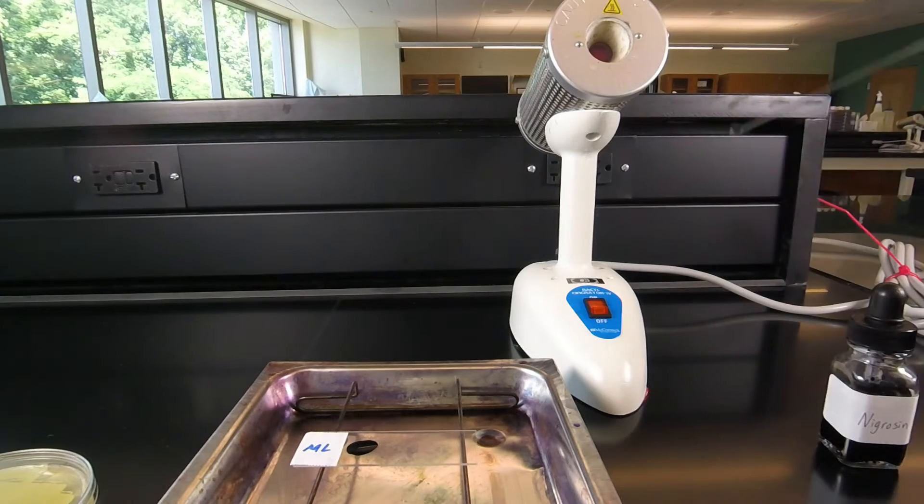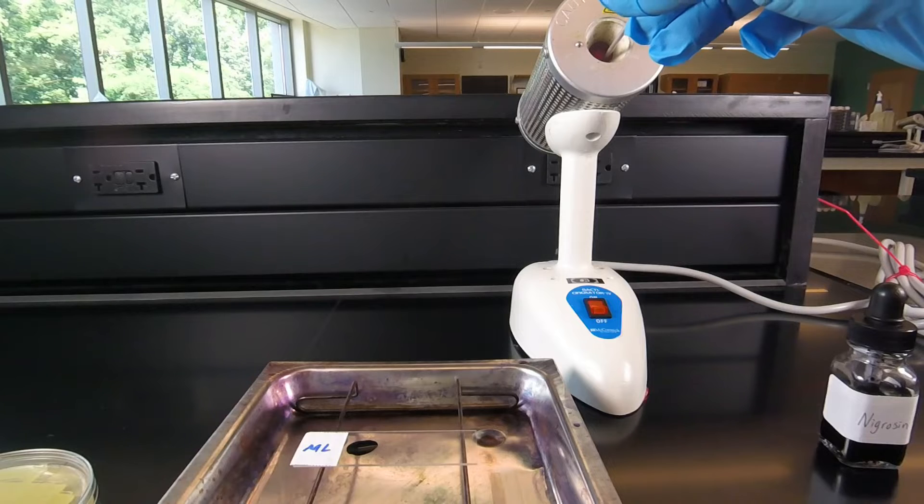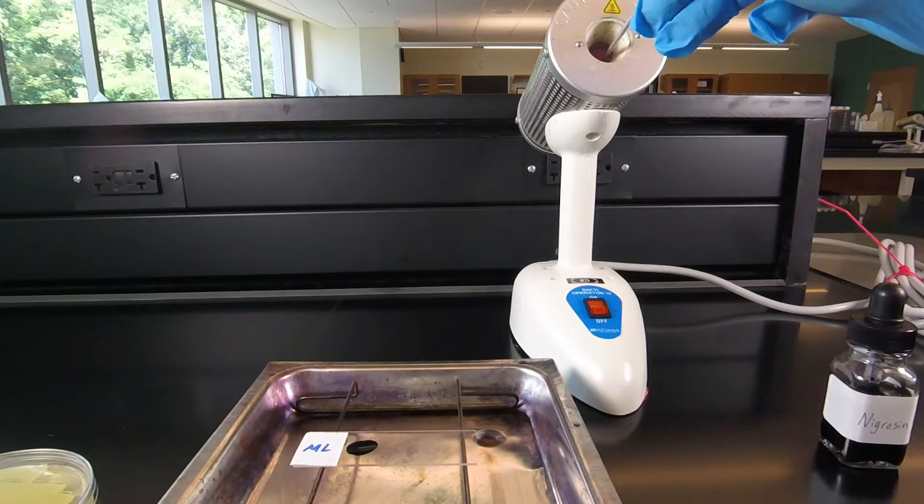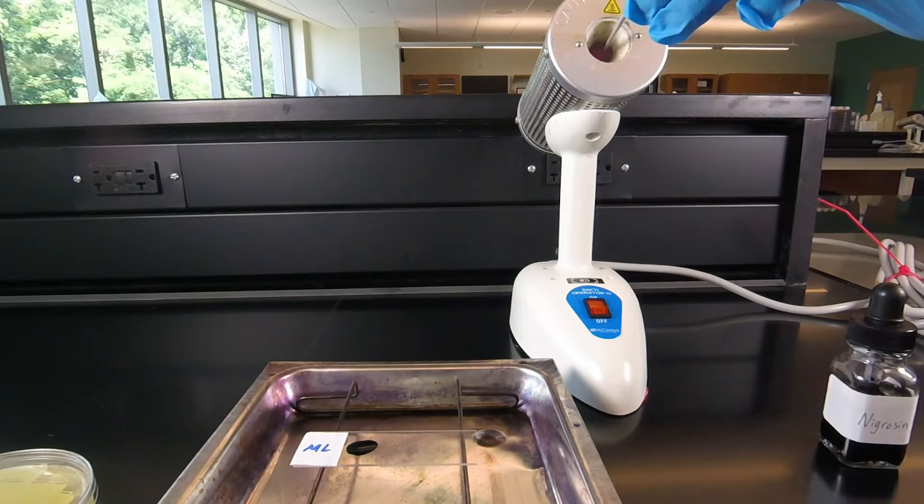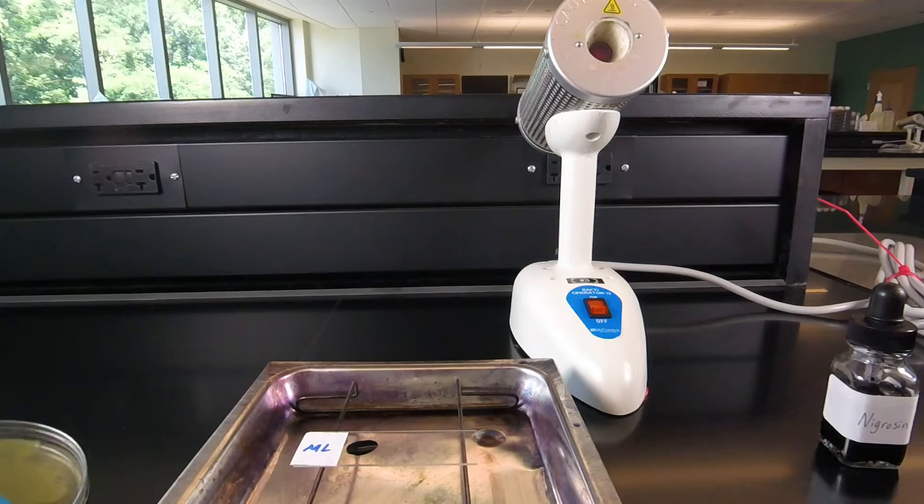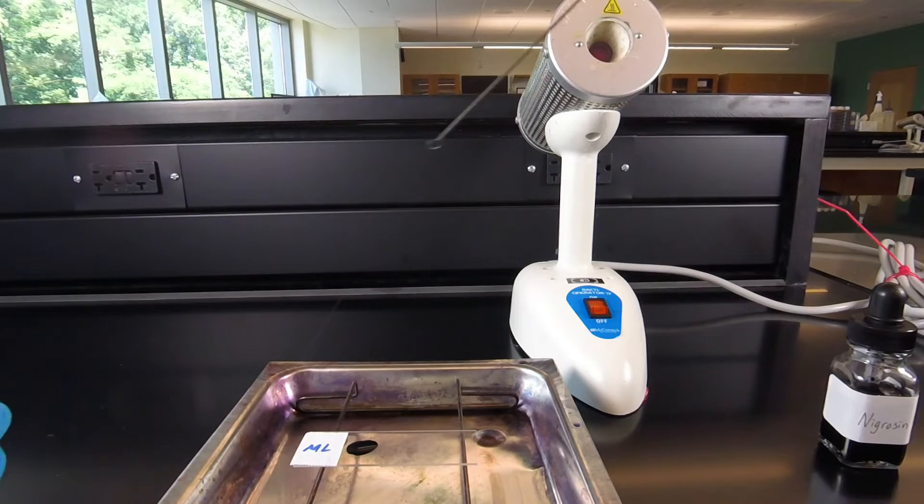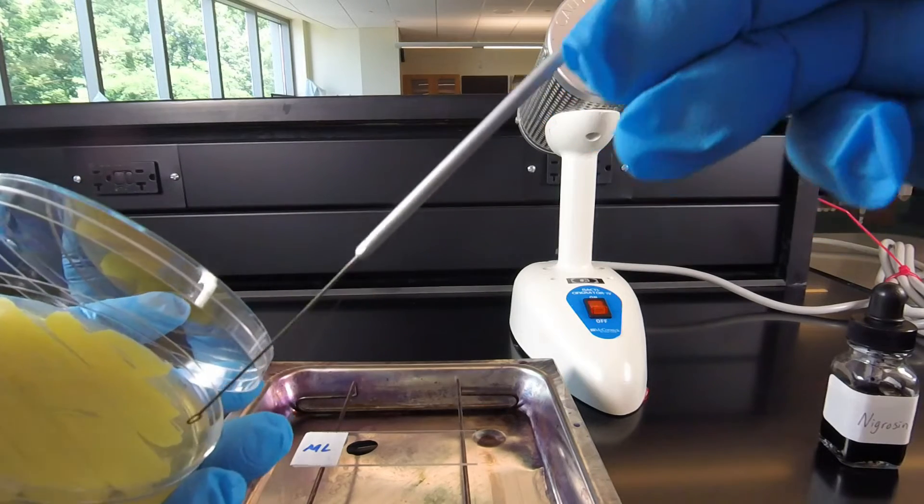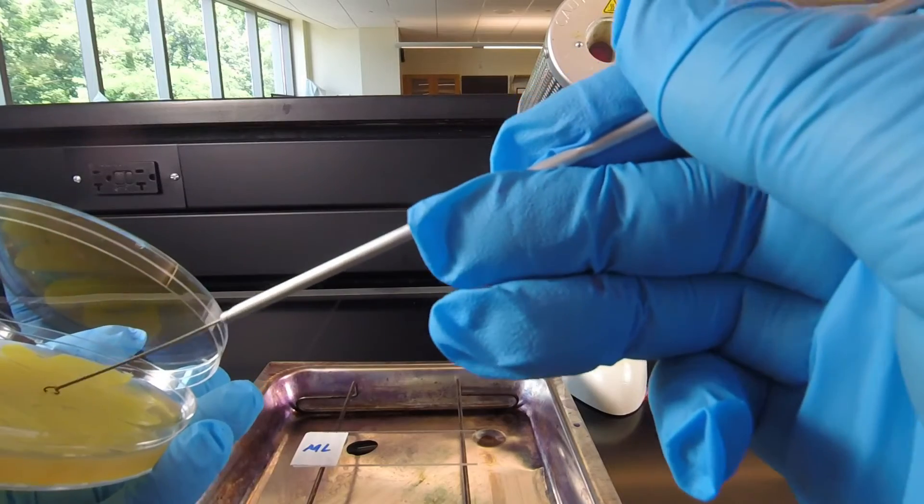Then we're going to add our bacteria to the dye. So we sterilize our inoculating loop, then stick the inoculating loop in the agar to cool, and we're going to scrape off some bacteria.